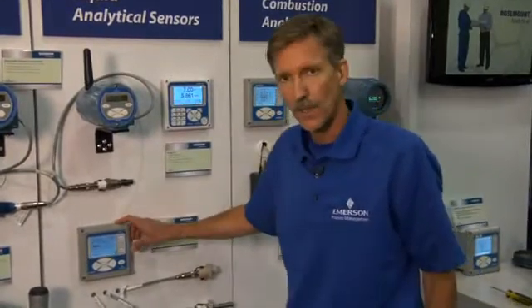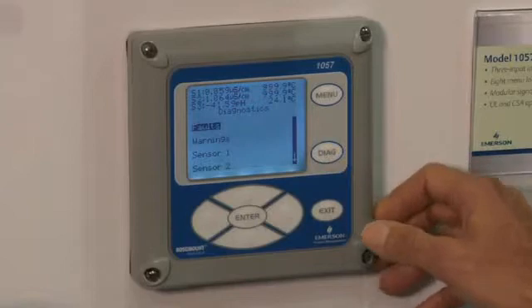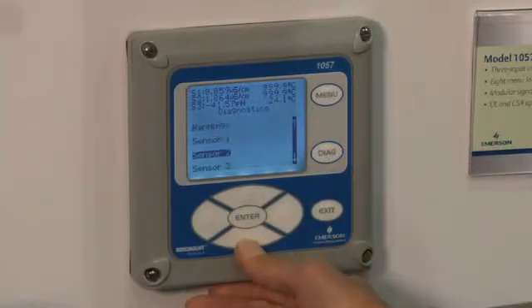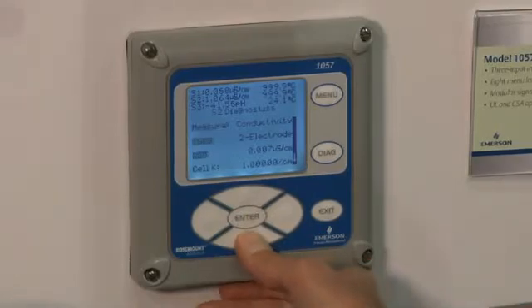The other feature I'd like to talk about with ease of navigation is the ability to diagnose a problem using the diagnostic feature of the Model 1057, by pushing the diagnostic button and then quickly determining the condition of any particular sensor input by pushing buttons on the unit and scrolling down.